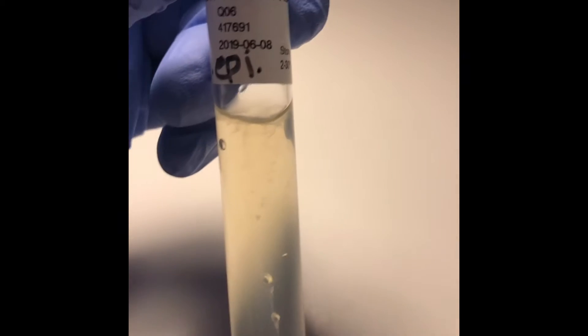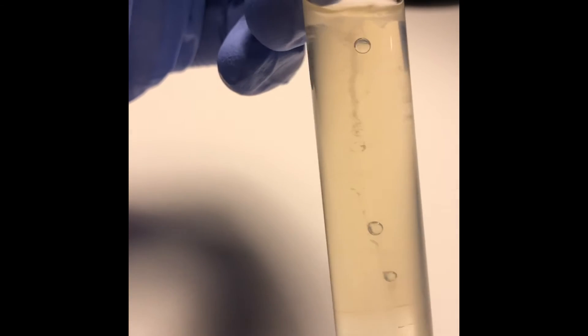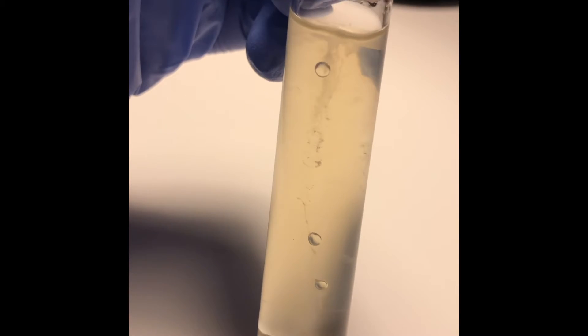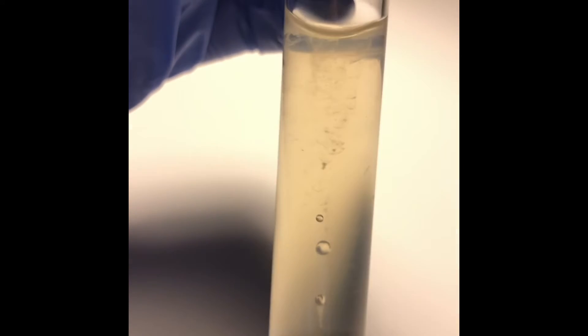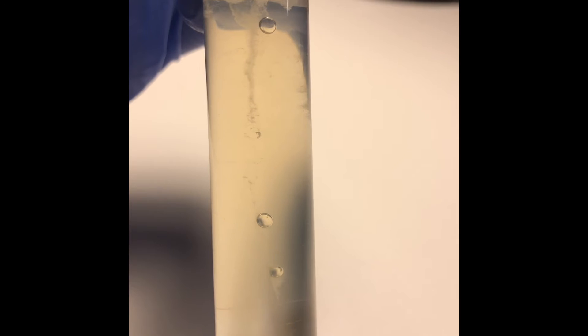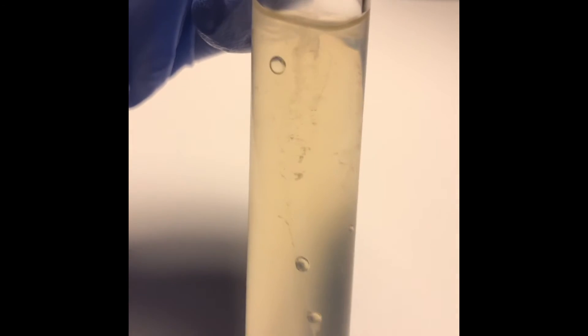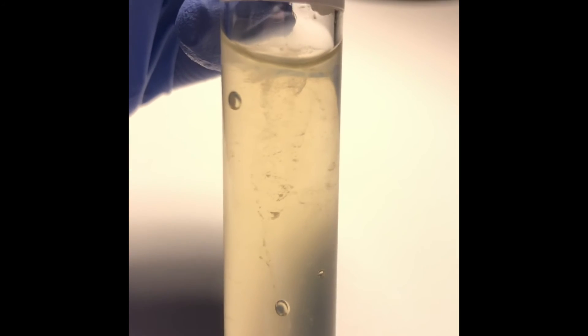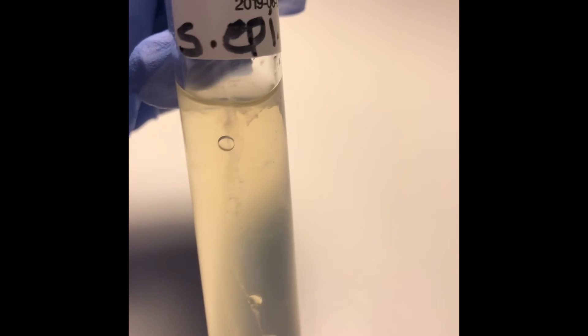For S. epidermidis, this tube required an additional 24 hours of incubation because there wasn't much growth initially, but after that extra 24 hours I did start to notice some signs of growth. What's interesting is that even though there are signs of growth, most of it is contained within the stab line, which indicates that S. epidermidis is non-motile — it can't move. There was a mold issue on my agar plate from a previous experiment that may have inhibited my results slightly. There is some minimal growth at the top, but it's very minimal compared to the E. coli tube, so S. epidermidis is definitely non-motile. That concludes my lab. Thank you.